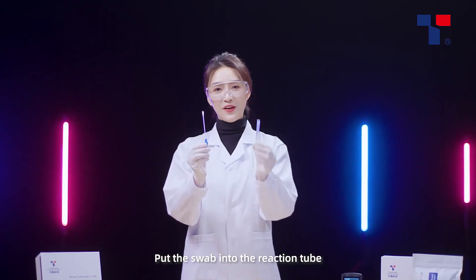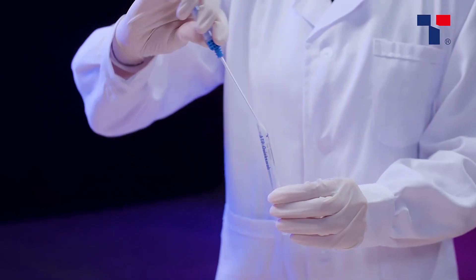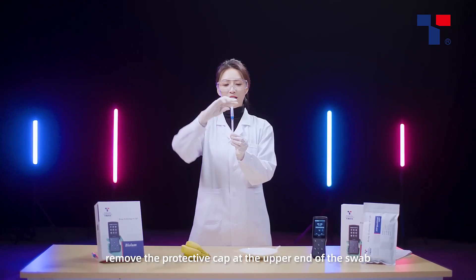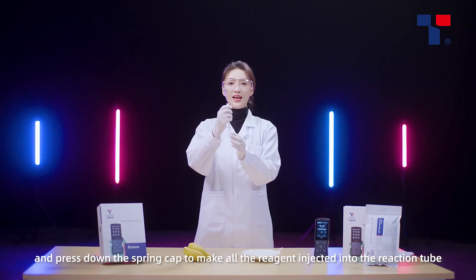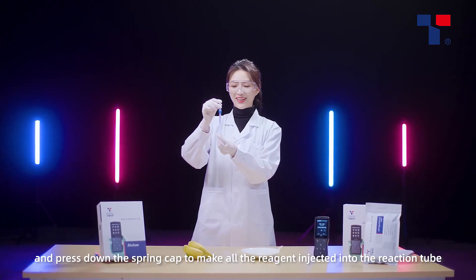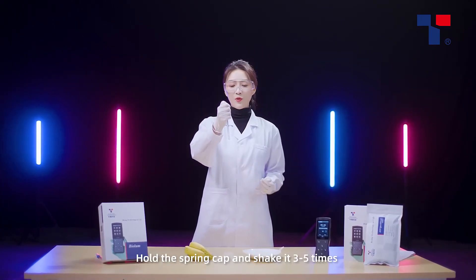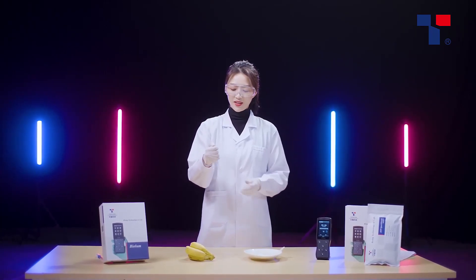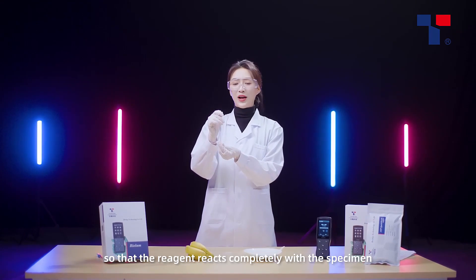Put the swab into the reaction tube. Remove the protective cap at the upper end of the swab and press down the spring cap to make all the reagent injected into the reaction tube. Hold the spring cap and shake it three to five times so that the reagent reacts completely with the specimen.